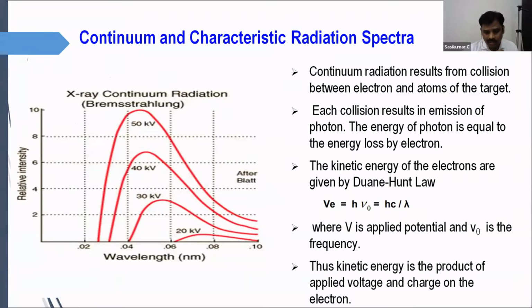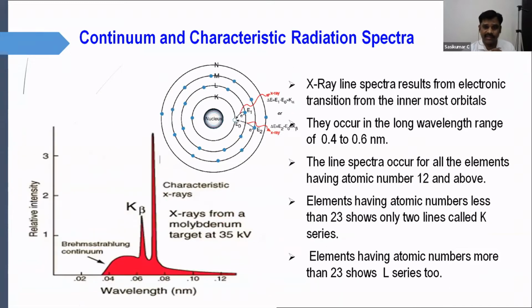I don't want to go into all the basic details because the time is restricted. When X-ray is incident on a material, electronic transition happens. How the electronic transition takes place, Dr. Ajita has already explained very clearly. This electronic transition gives rise to what is called X-rays.